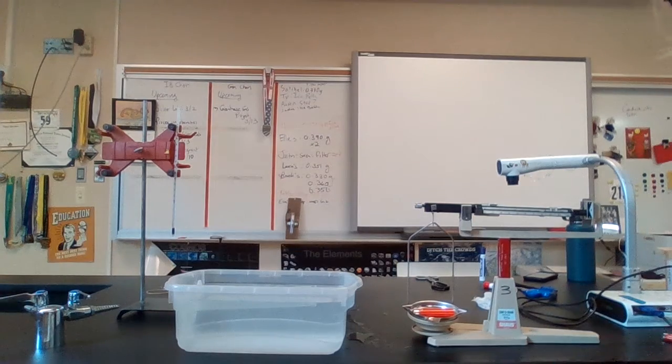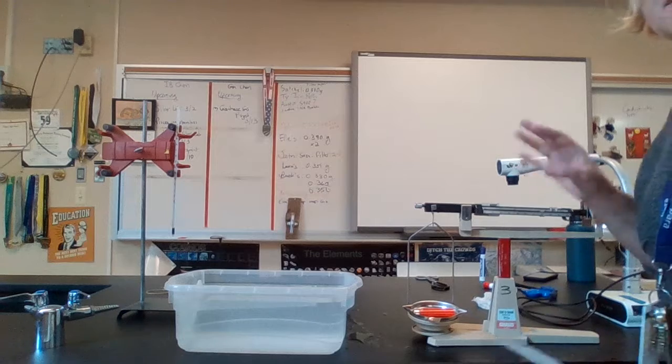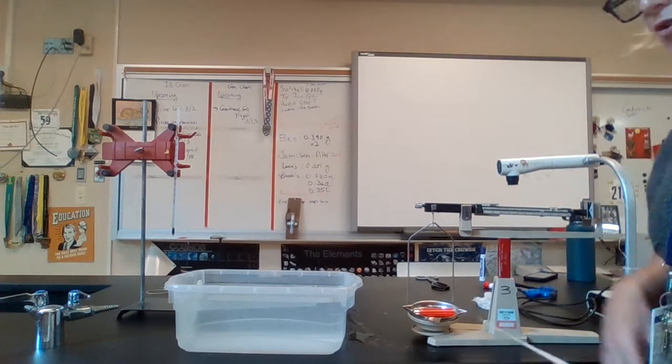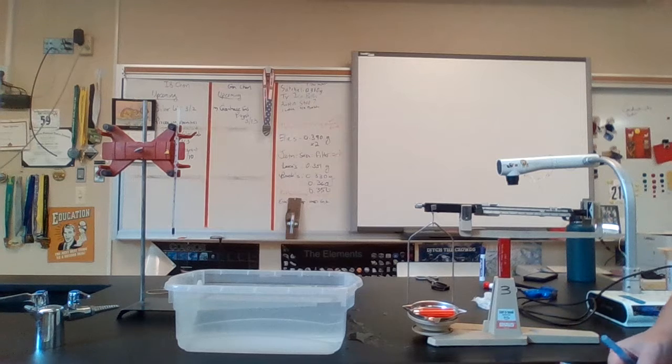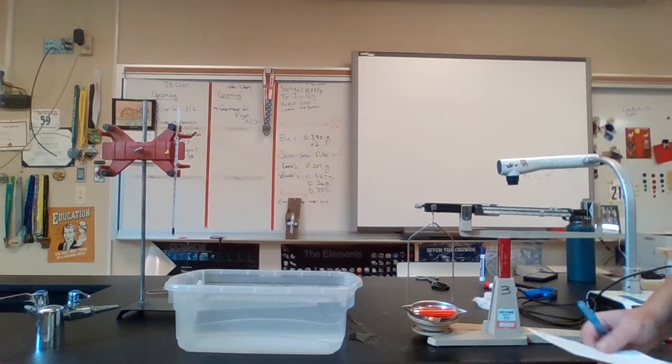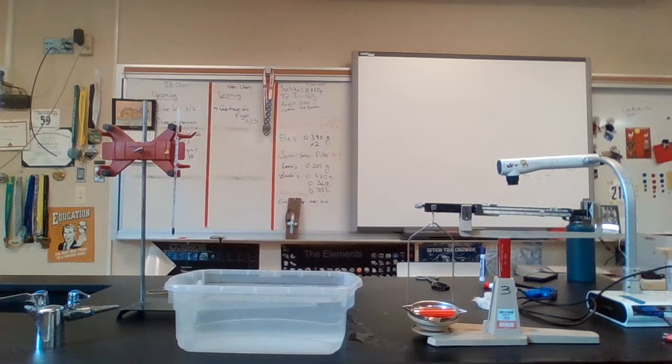I'm going to take its mass, and I'm just going to ask you to trust me when I read this off for you. All of this data is going to be located on Schoology for you. I find the mass of the lighter before I release some gas of 19.700 grams. You can write that down now if you so desire, but again, it's going to be listed in Schoology.